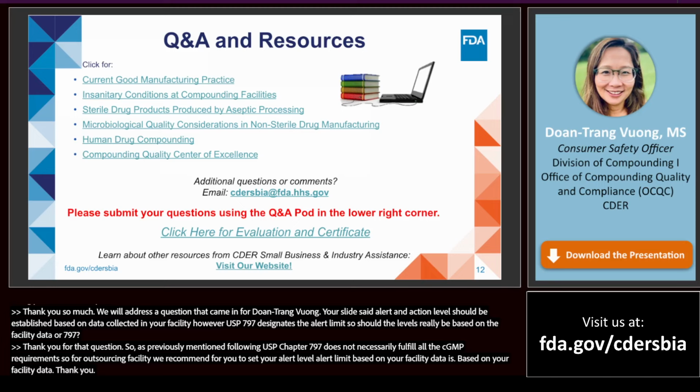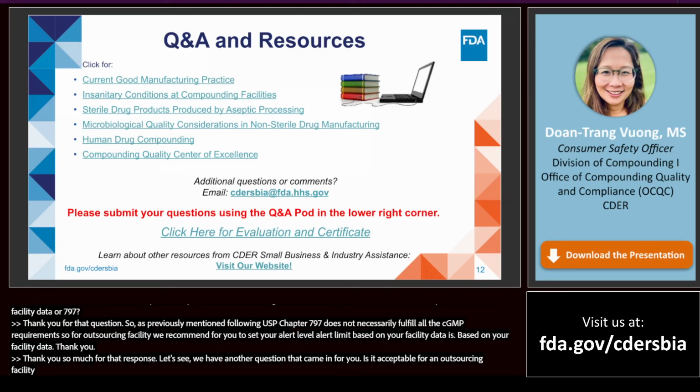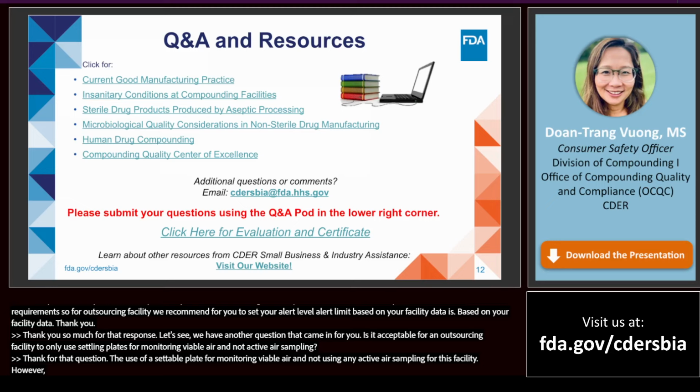Let's see, we have another question that came in for you. Is it acceptable for an outsourcing facility to only use settling plates for monitoring viable air and not use any active air sampling? Thank you for that question. No, using only settling plates for monitoring viable air, and not using any active air sampling, is not acceptable for an outsourcing facility. However, the use of settling plates is optional if you have active air sampling that is performed adequately.